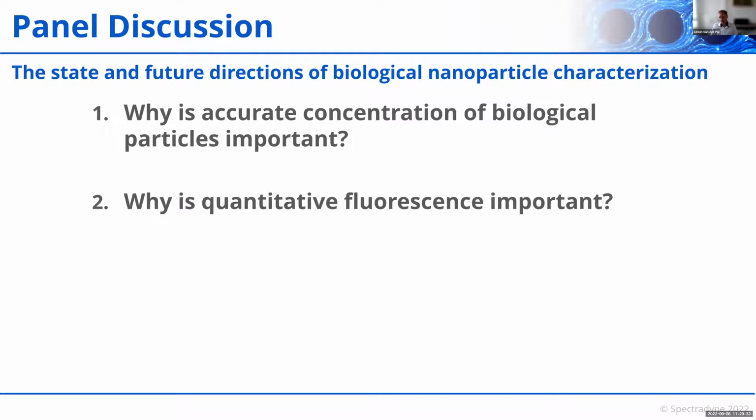So the detection method should be able to identify these particles of interest, and immunofluorescence labeling or other ways of fluorescence staining are an established way to identify biological particles. While immunofluorescence labeling or staining procedures are broadly applied to identify cells, it can also be used to study submicrometer particles.